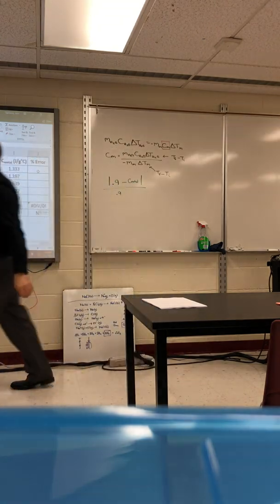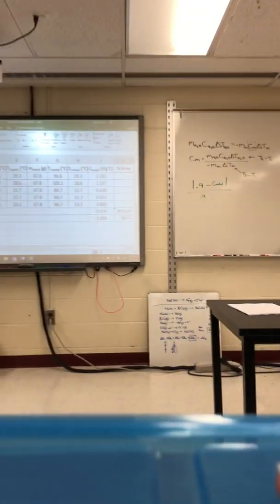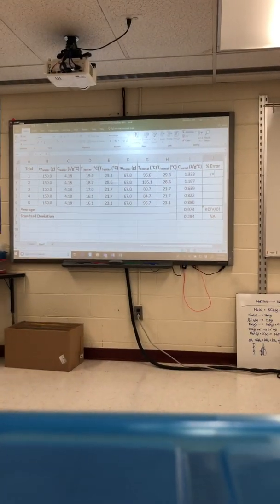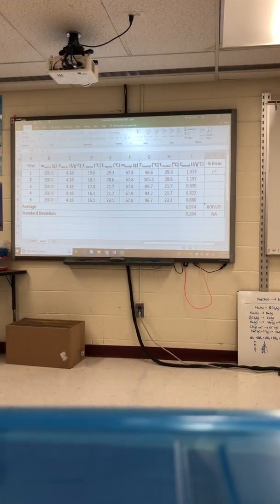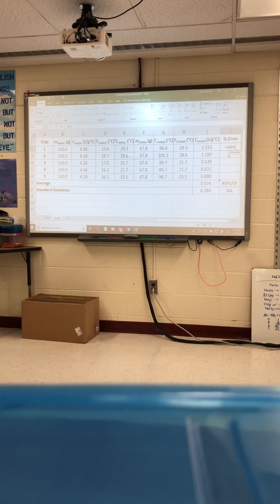So we're back to our Excel sheet, and we can say up here, I'm going to use my equal sign again. I'm going to say ABS. And just to make sure, you guys see how it tells you what this is? Returns the absolute value of a number without a sign. So I'm going to put it in parentheses.